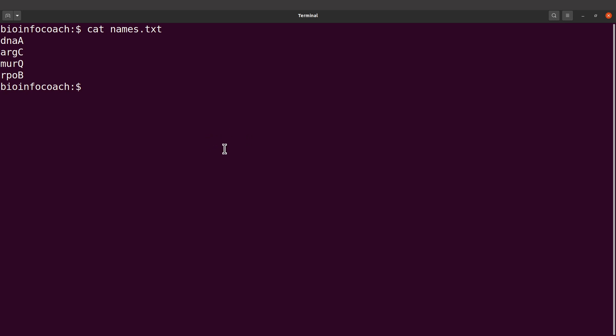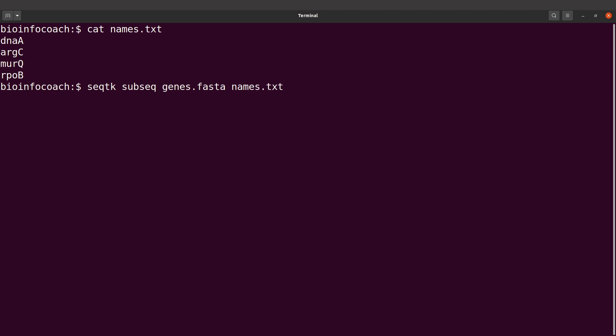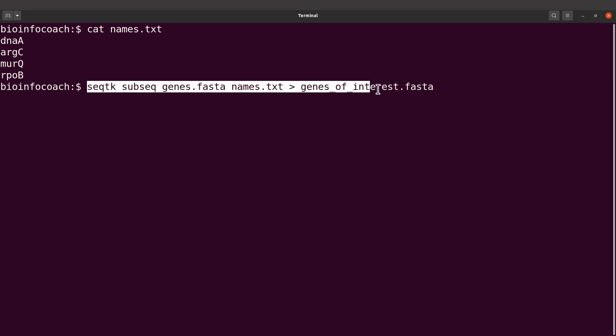To extract the contents, you say seqtk and I believe you have already installed seqtk. You type seqtk, then you say subseq. Then you specify your input file, that is genes.fasta. And then you indicate names.txt. Then we supply it with our output file. The output file can be genes_of_interest.fasta. This is the final command that we will use.